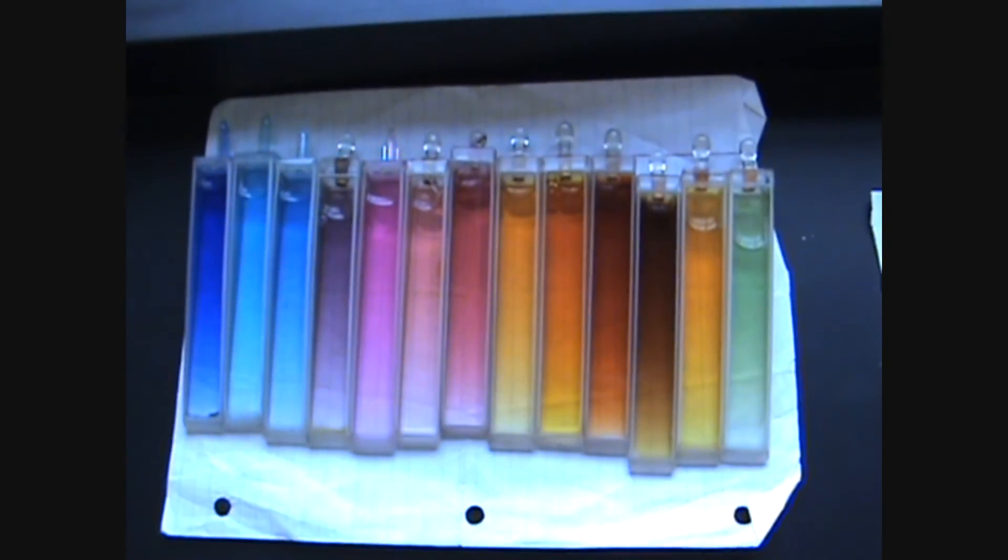Fructose. Ketones. Salicylic acid. Cholesterol. Blood sugar. Creatine, so you can check your kidneys are working. Phenolphthalein, to check the concentration of your acid. Bilirubin. Not Billy Idol. Look how beautiful these wedges are.